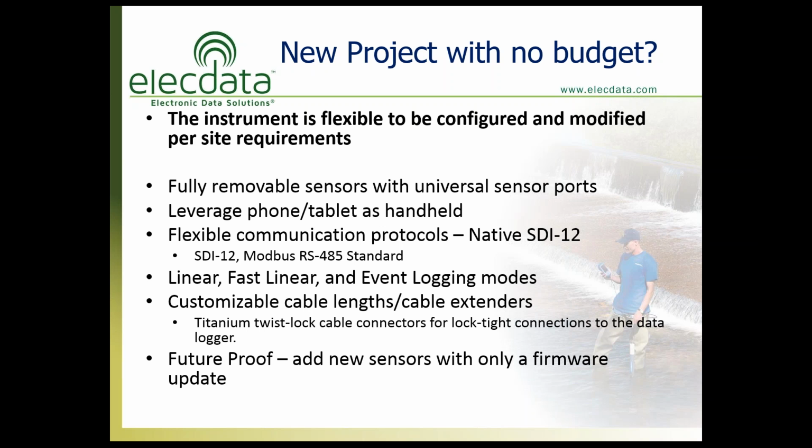So if you're doing a stormwater type of monitoring, you can say, okay, I want you to look at the sensors or make a measurement every 5 minutes, but I only want data logged if X change occurs, and that change can be maybe turbidity going over a threshold of 50 NTUs, or a change in the conductivity reading. And when that condition happens, you can say, okay, I want you to actually log at that 5-minute rate. So that could be a change in water level or a change in one of the other water quality parameters.